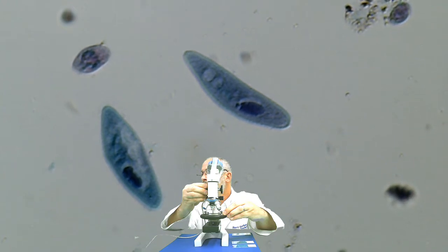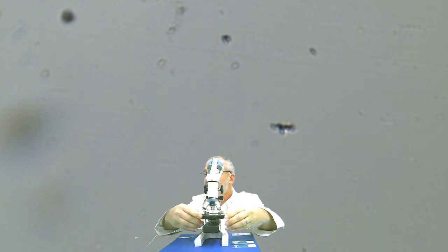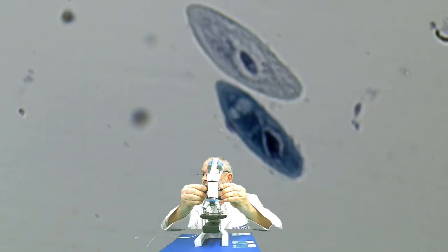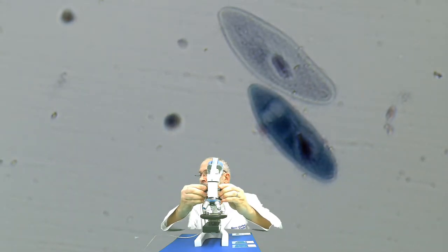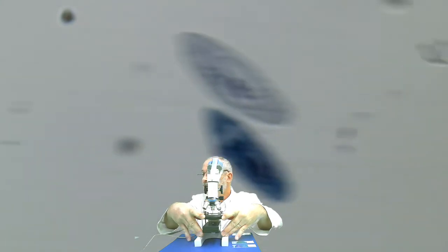Draw what you see as accurately as you can, but also keeping in mind that they are all to scale with one another. So what you are viewing right now under 40 times magnification is the same scale that you were viewing the amoeba under 40 times magnification.